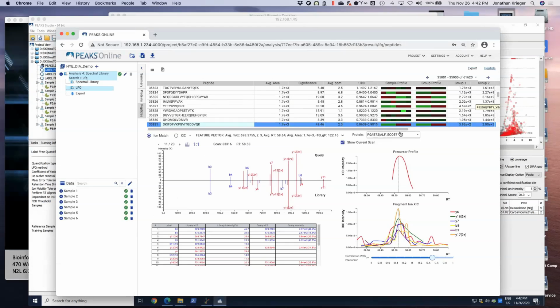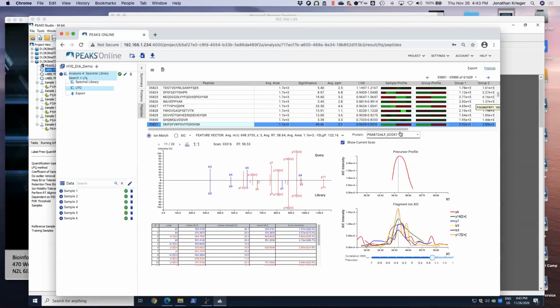Stephen asks if PEAKS X Plus can use LCM data and LFQ, and let ID transfer from one or more. Yeah, so the same thing should work in Xpro, Stephen. I don't know what version of X Plus you're using, what build, if it's 0219 or 0415. One of the major changes between X Plus release 0219 and the later versions, as well as Xpro, is the inclusion of the Bruker SDK in reading the Bruker data.